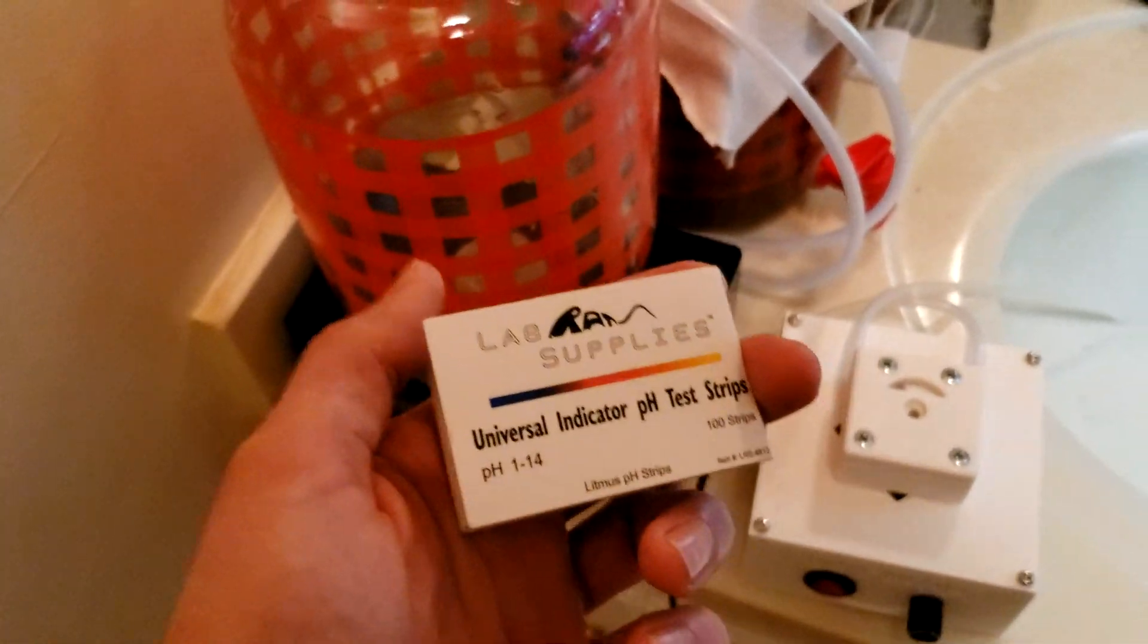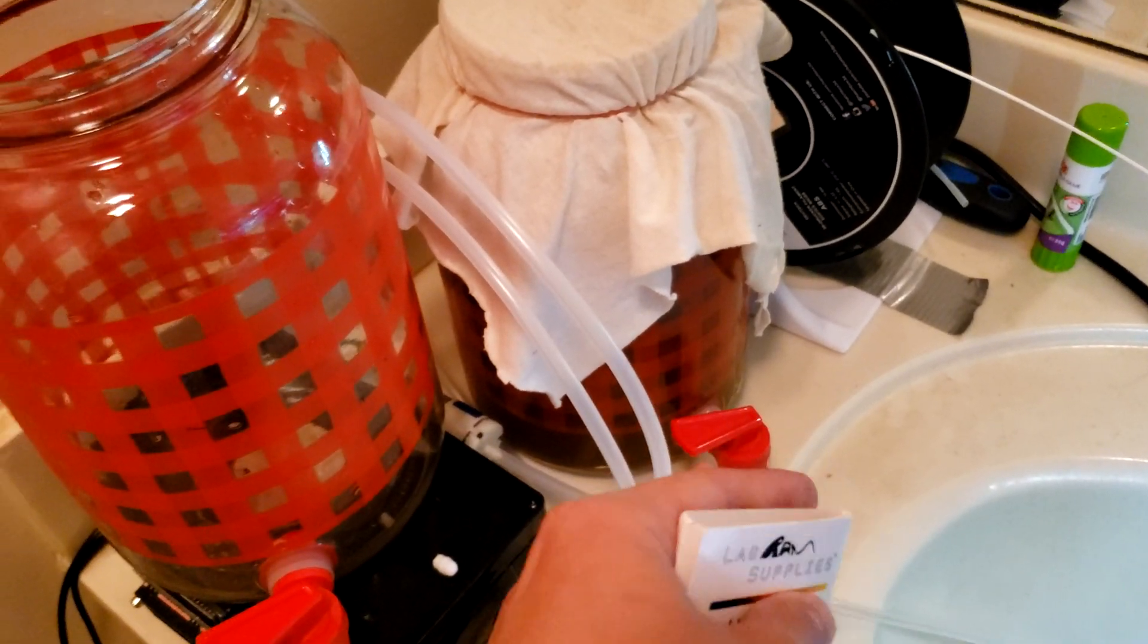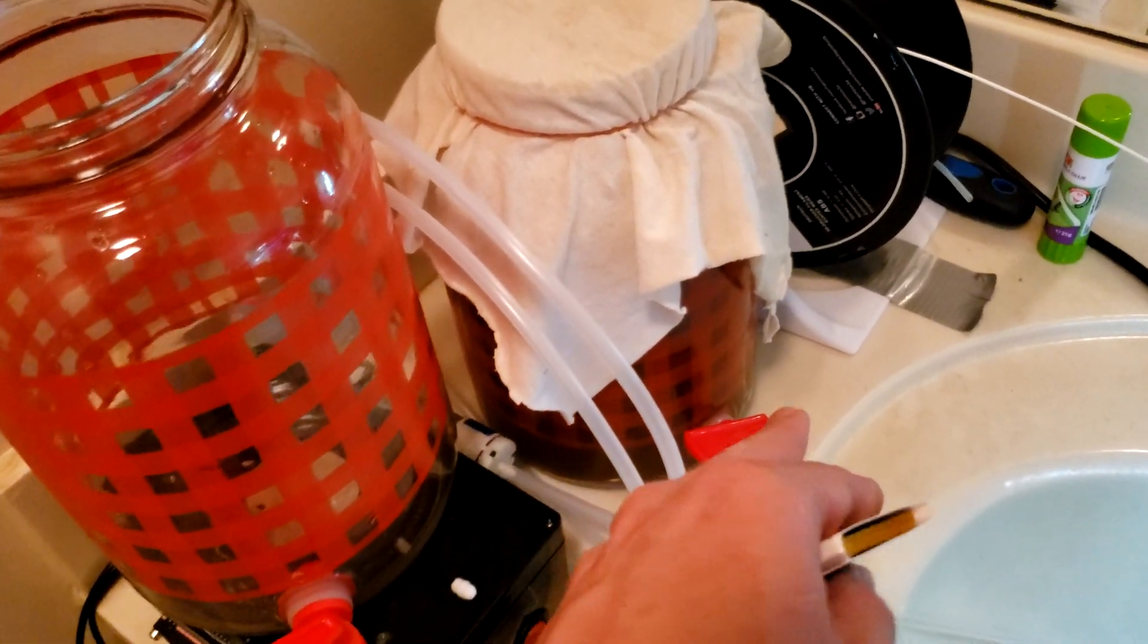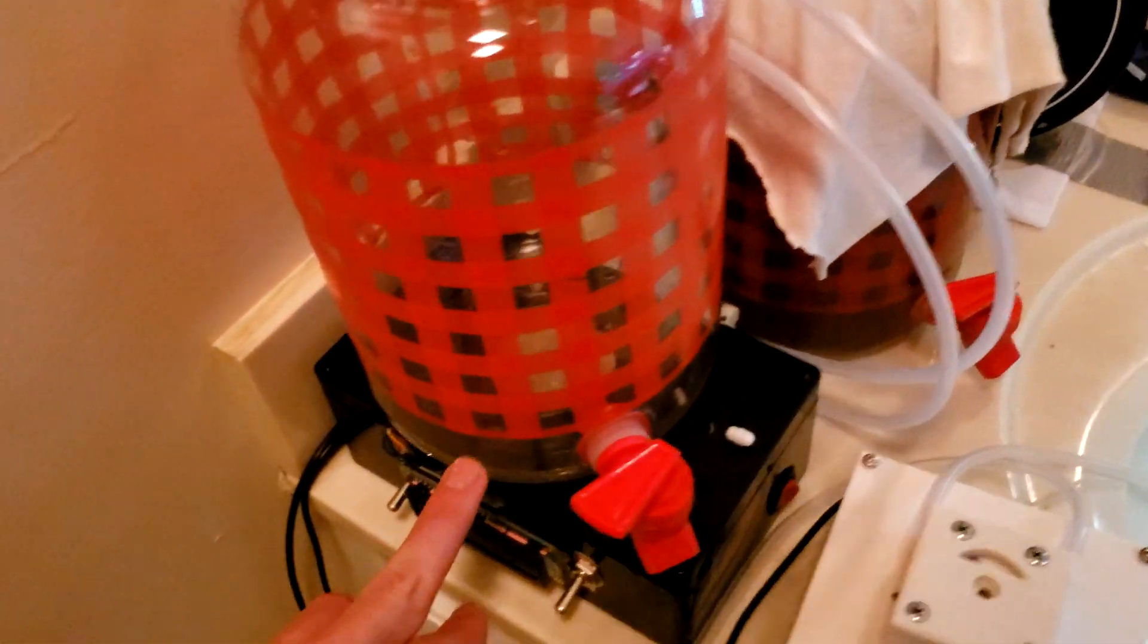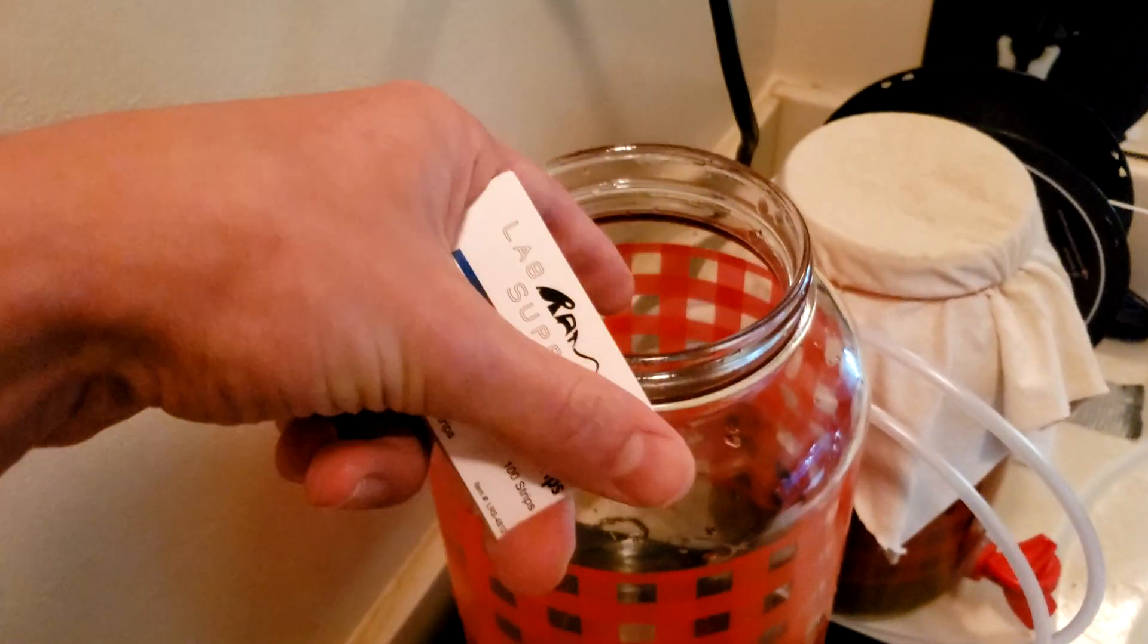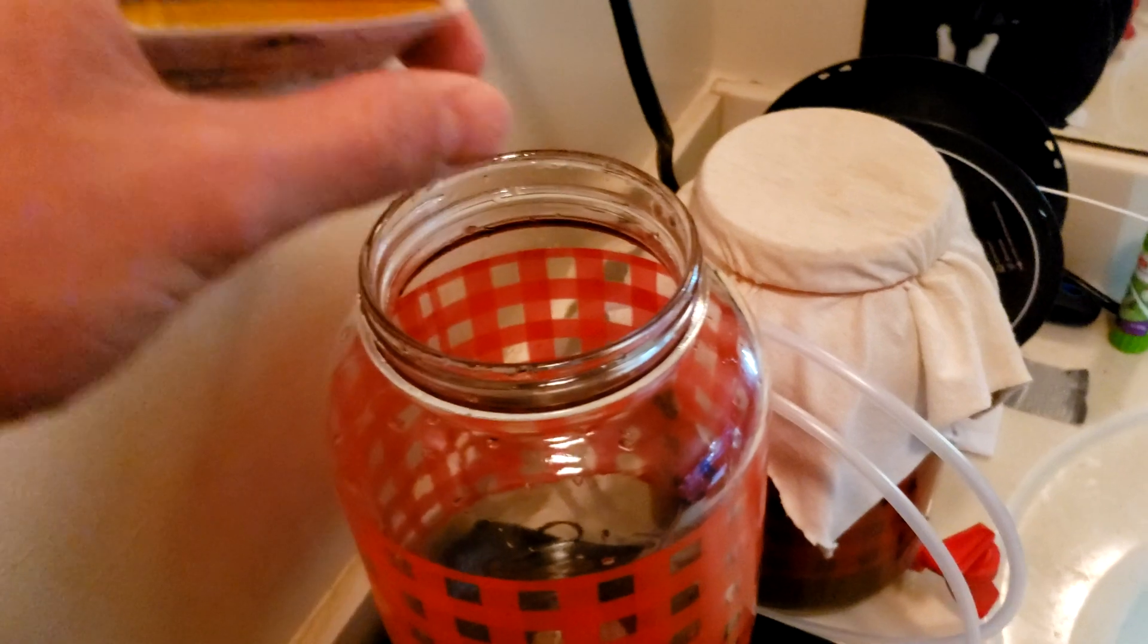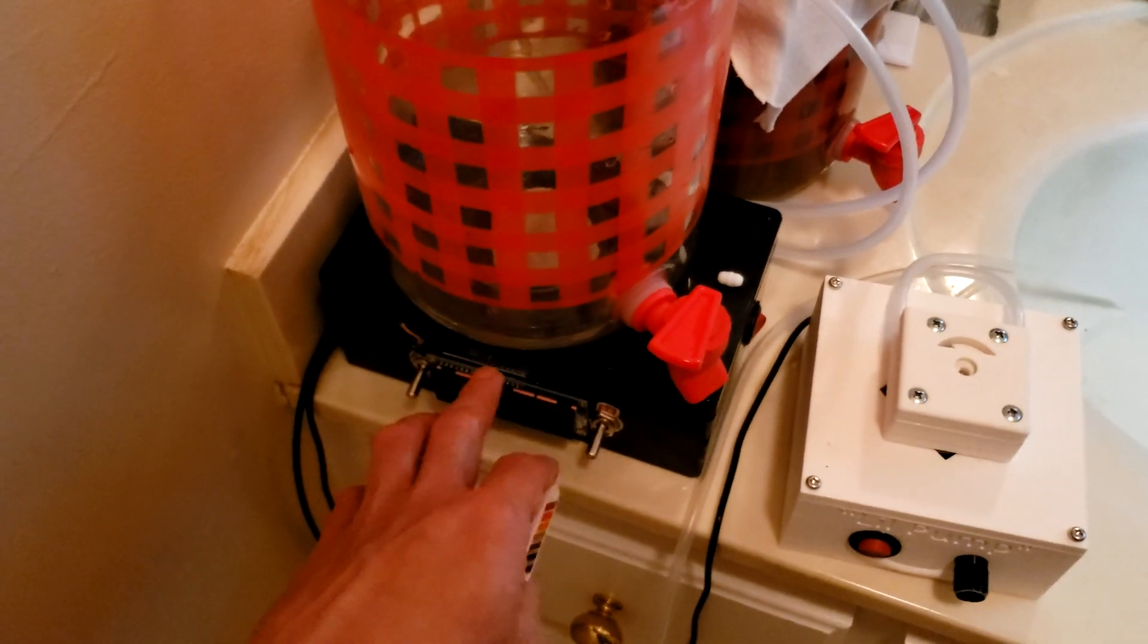Now this will give us really low resolution of what's actually going on between the two different processes, but it will at least give us an idea of what's happening. So I started this brew, I think, two days ago, so the pH should still be pretty high. I'm going to take some of this, maybe a cup or two, fill it up to probably this line, throw in the stir bar. I'll throw in the air line just so that it's blowing air into the vessel, but not bubbling it through.